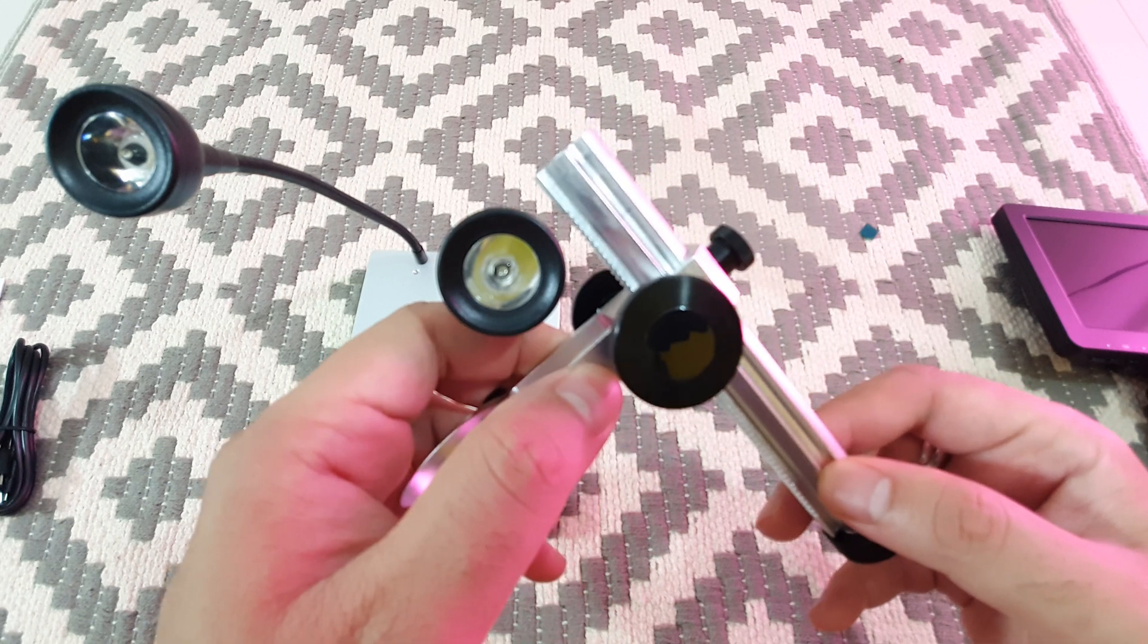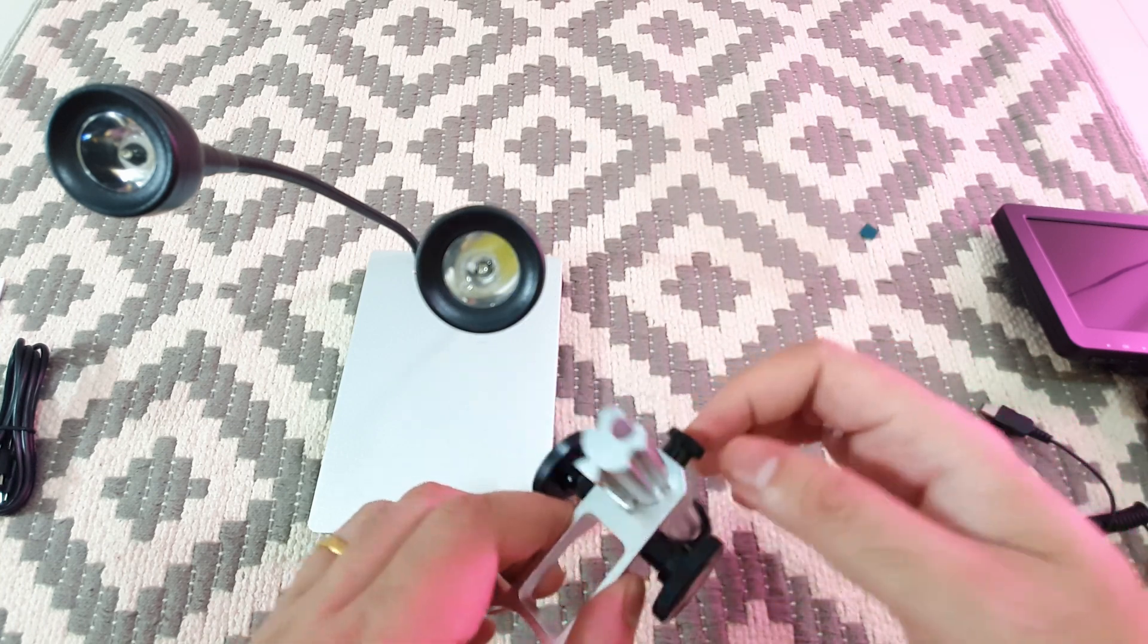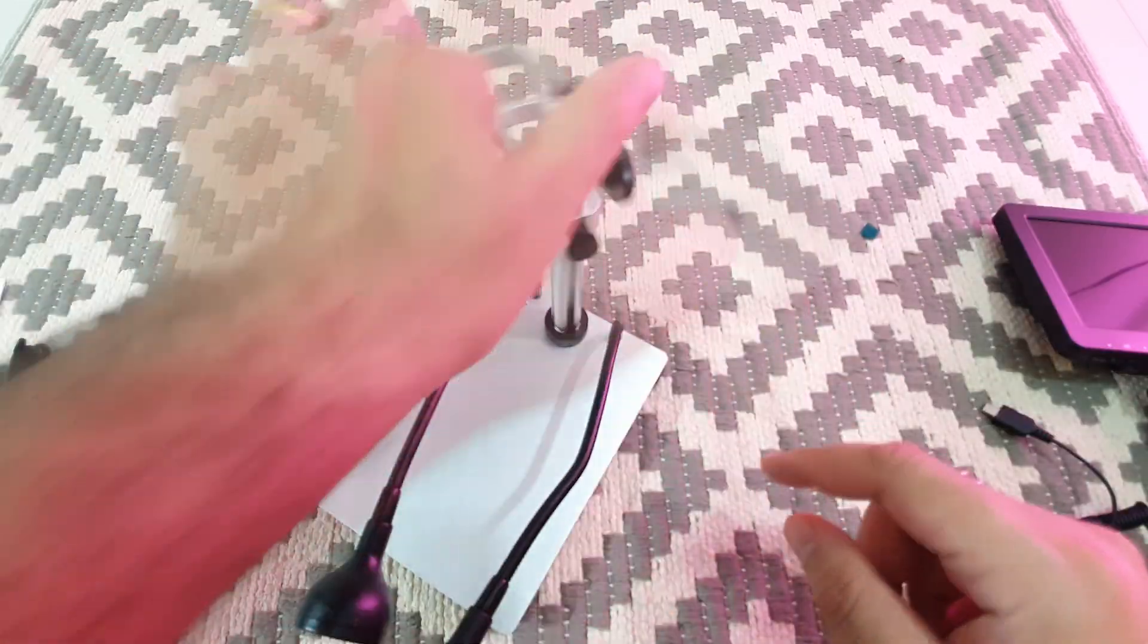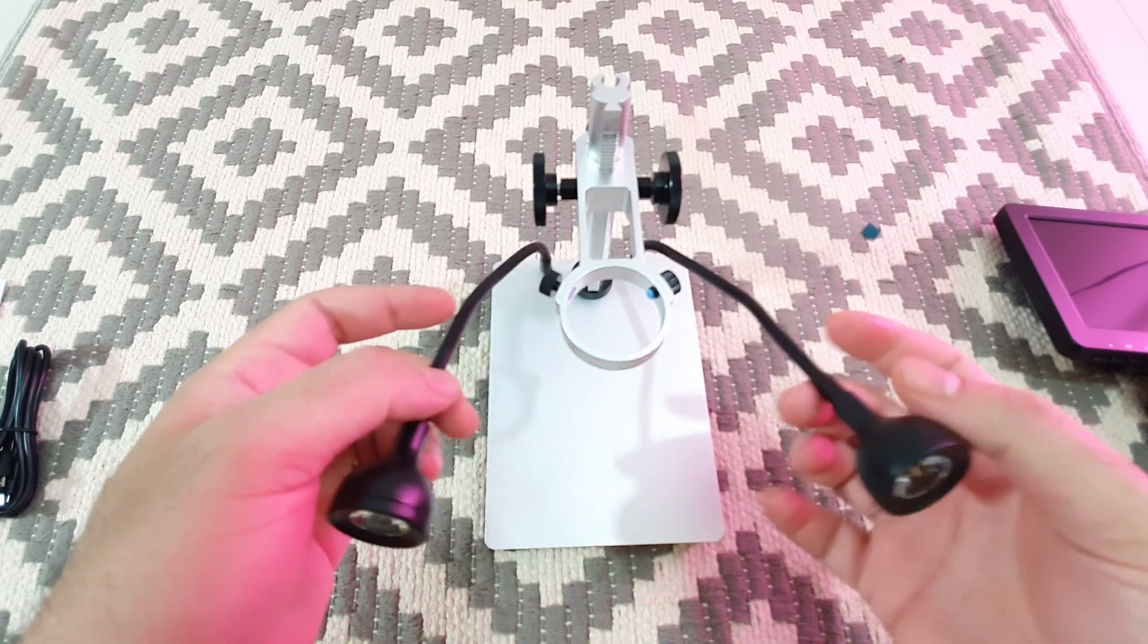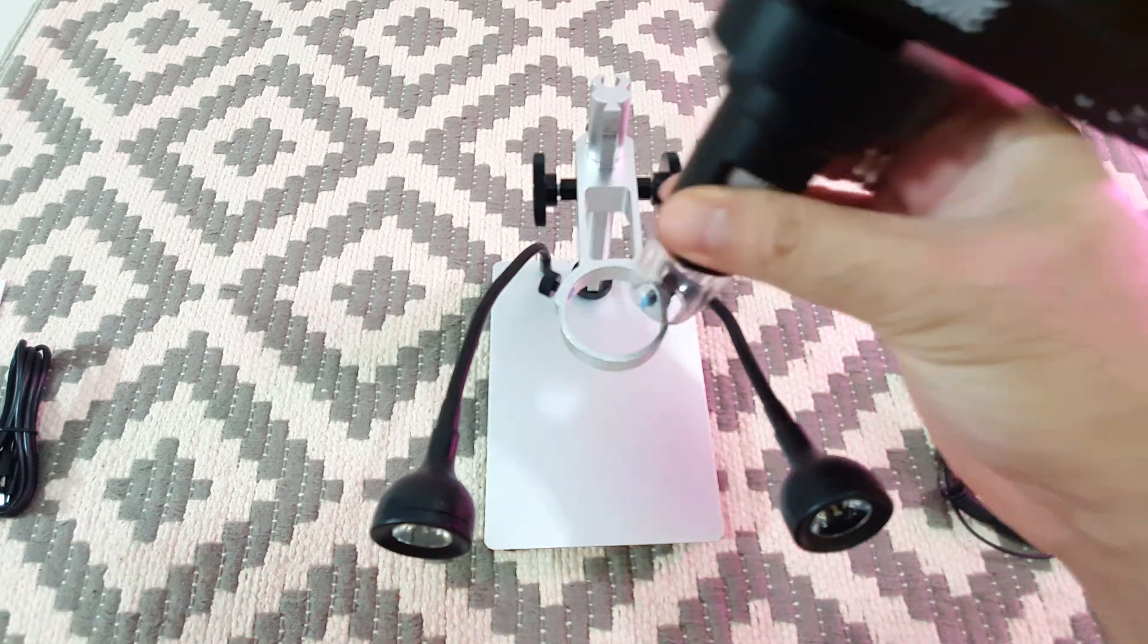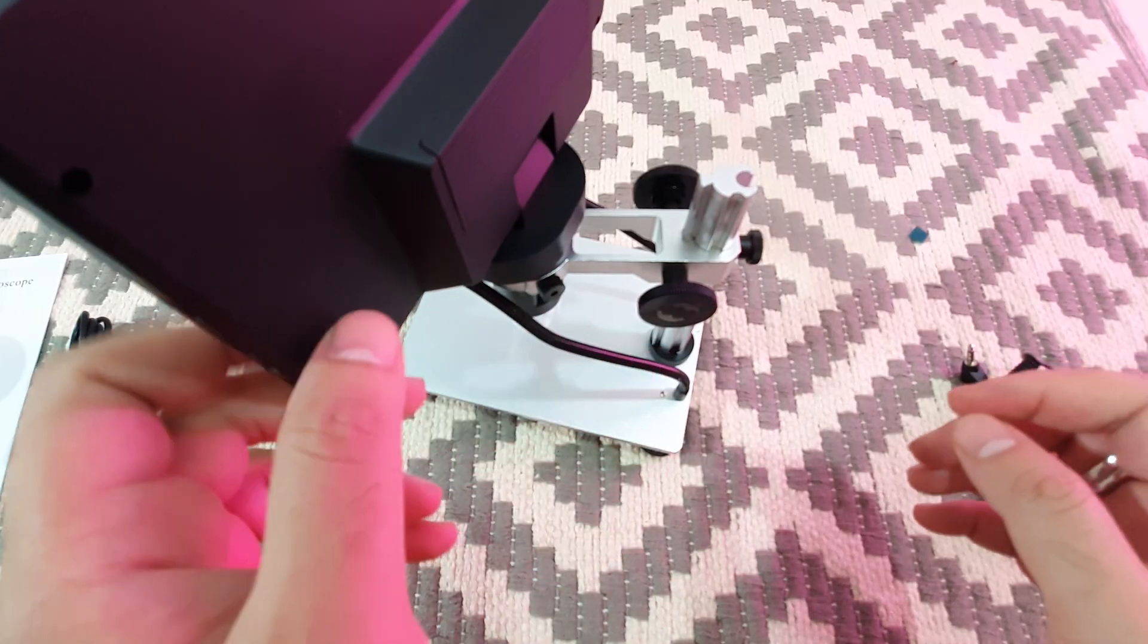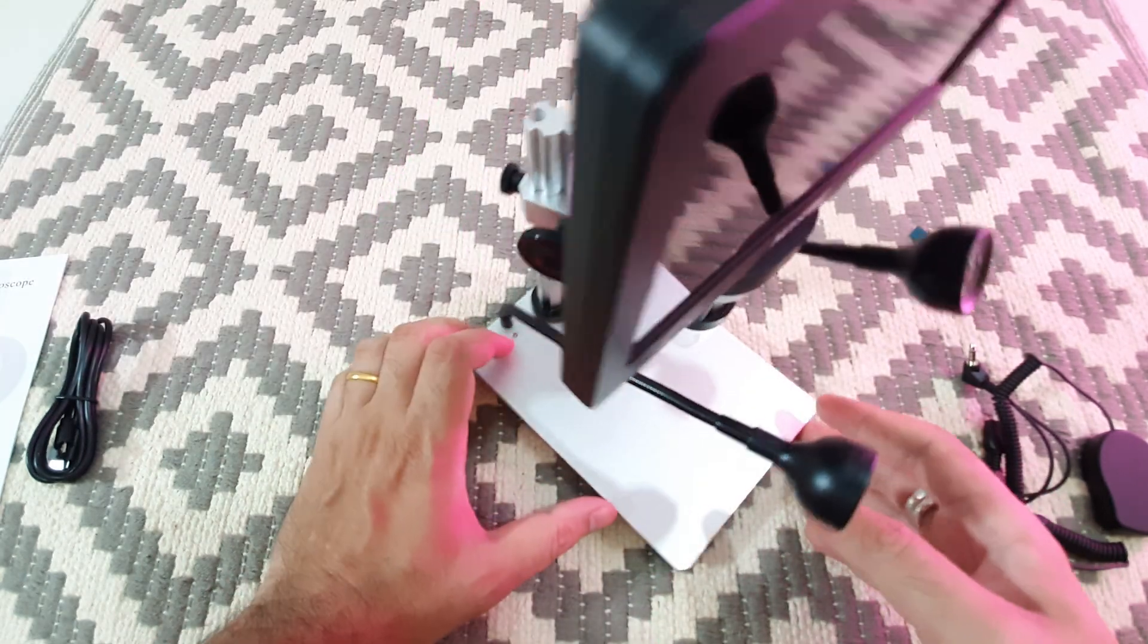I'm going to start assembling this. This is a height adjustable stand and you can see that it has these grooves on which this moves. Made of aluminum so it's pretty sturdy. It's got a locking screw as well. It's pretty simple to assemble this. There is a small threaded screw at the bottom which lets you adjust the placement. And then all you do is just plug in your monitor on top of the stack. It's as simple as that. There are some screws which actually tighten the hold of the screen on this metal mount. Once you have it in place you can just tighten the screw.